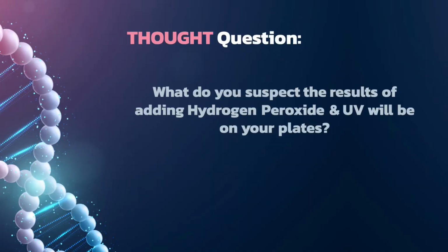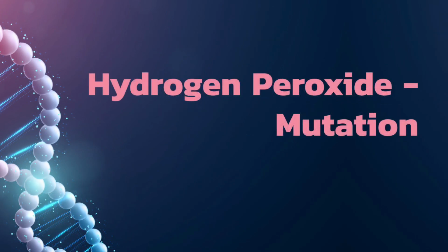Now that the spontaneous mutation experiment is complete, I would like you to begin thinking about how you believe adding hydrogen peroxide and UV will influence the mutation rate that you observe on your plates.